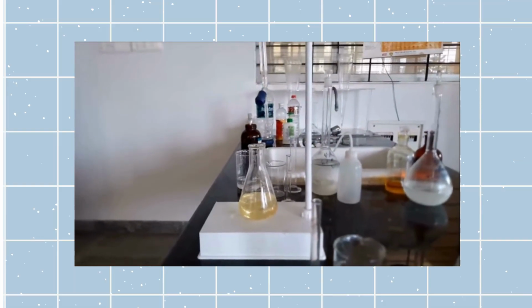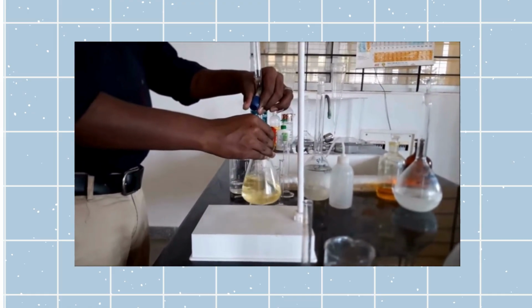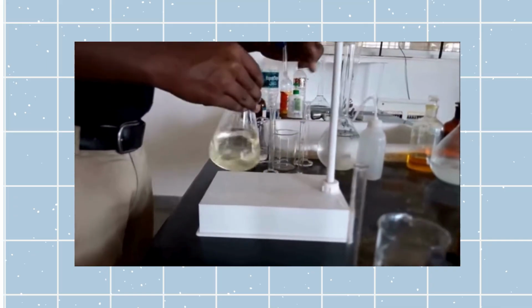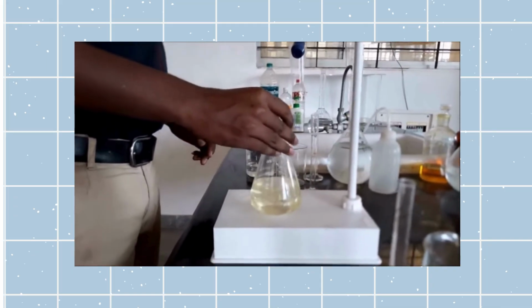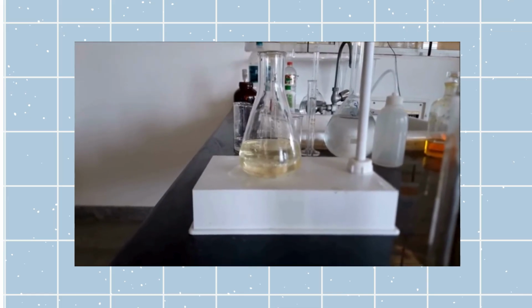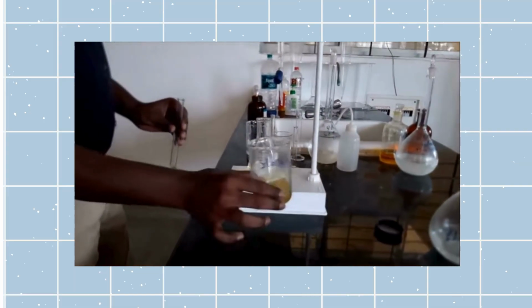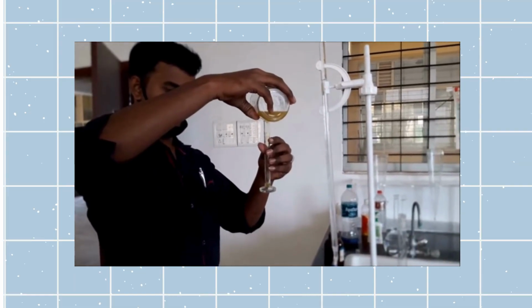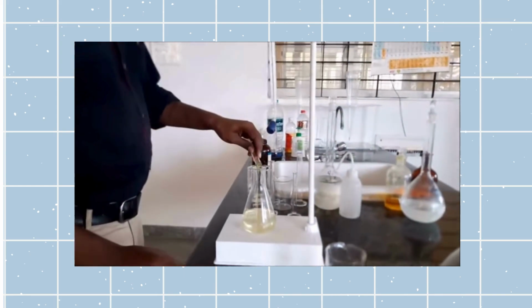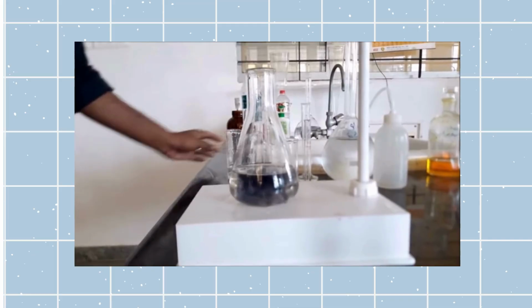Now this will be titrated against standard sodium thiosulfate solution. As you see, the dark yellow color has changed to pale yellow. The color has faded out. After this, add the starch. 1 ml of starch is measured and added to the same sample. As you can see, it has turned dark blue.